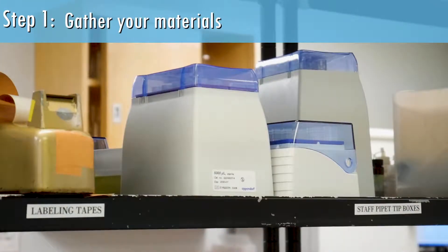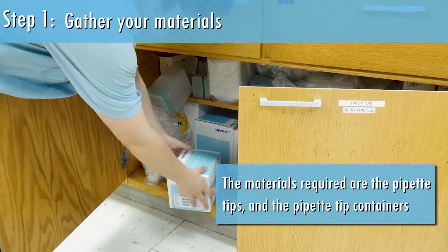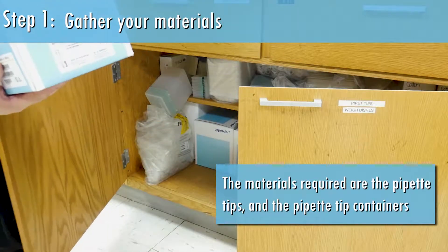Step 1: Gather your materials. The materials required are the pipette tips and the pipette tip containers.